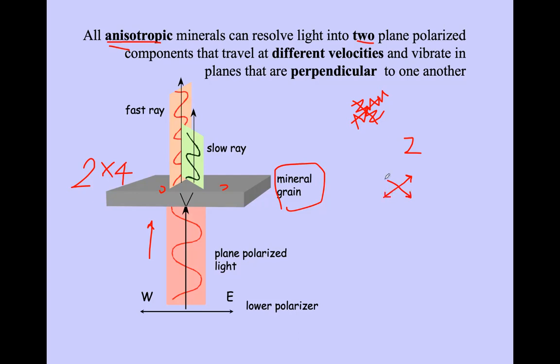The light beam travels in the same direction, because it is aiming at your eye, at the eyepiece, the ocular of the microscope. It doesn't go here and there, everywhere. The only thing is that the vibration directions are perpendicular, two directions. So this light beam will be passing like this, up to your eye, the ocular.